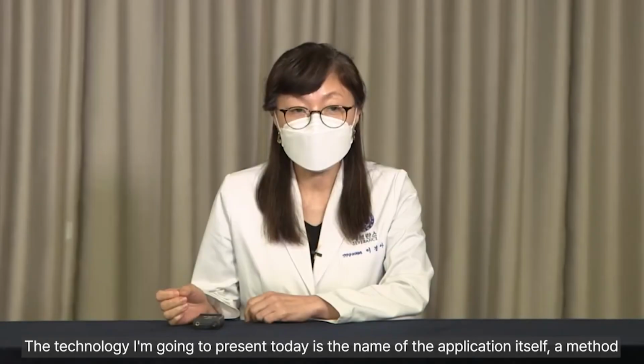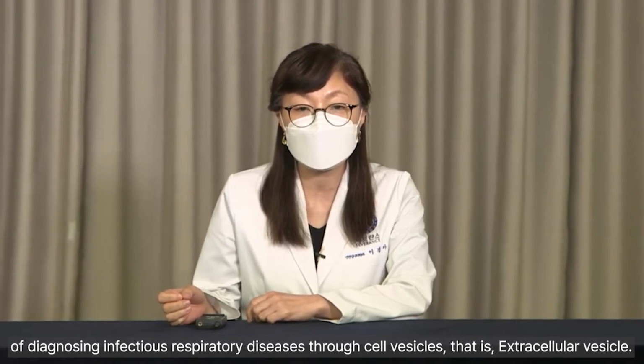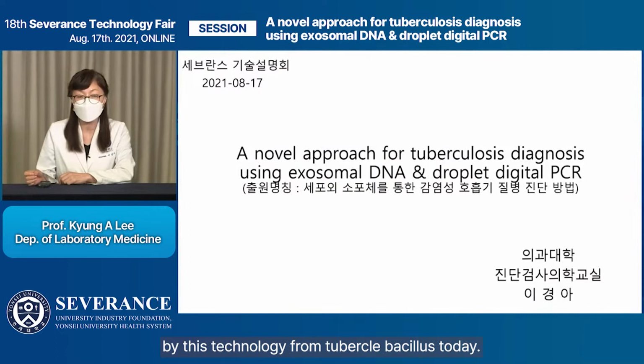The technology I'm going to present today is the name of the application itself. A method of diagnosing infectious respiratory diseases through cell vesicles, that is, extracellular vesicles. Among them, I would like to show you the data from applying this technology to tuberculosis today.